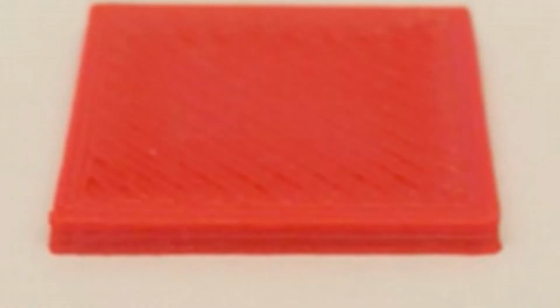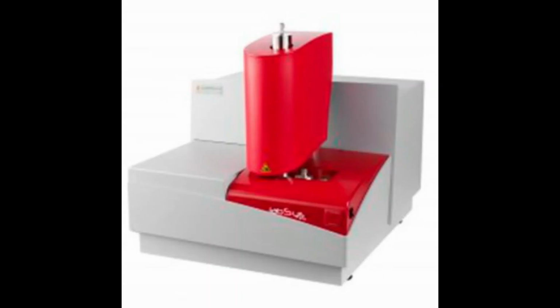3D printing was used to create the specimens to be studied. Their dimensions were 2 millimeters by 2 millimeters by 1.5 millimeters. All the parts were printed with 100% infill, which means it's a solid part, with a heated bed at 60 degrees Celsius, a nozzle of 0.4 millimeter diameter, and a printing temperature of 200 degrees Celsius.